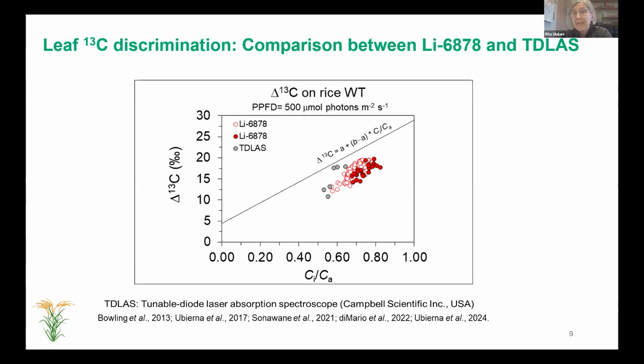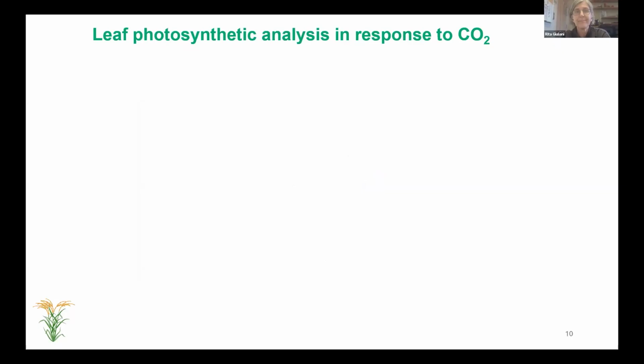We see that the variability among the single biological replicates for the new tracer data is not higher compared to what we have in the TDL measurements. And this is a positive response.